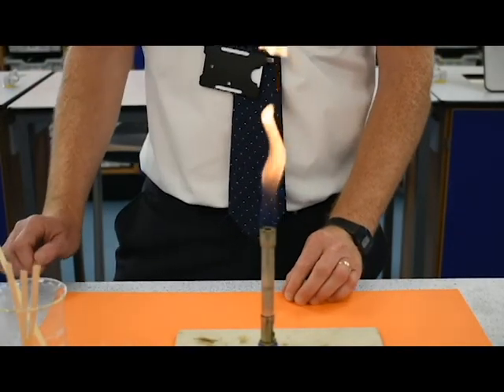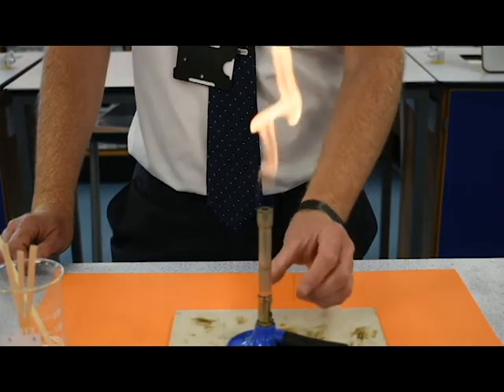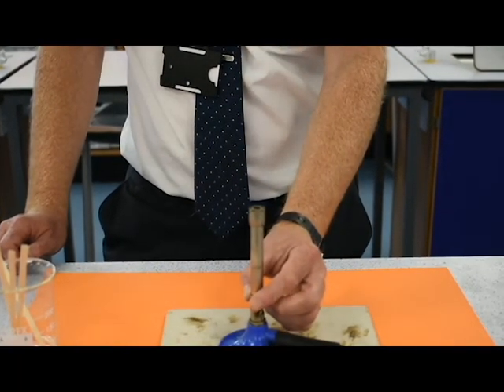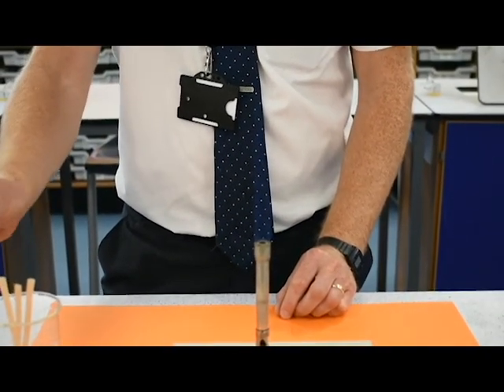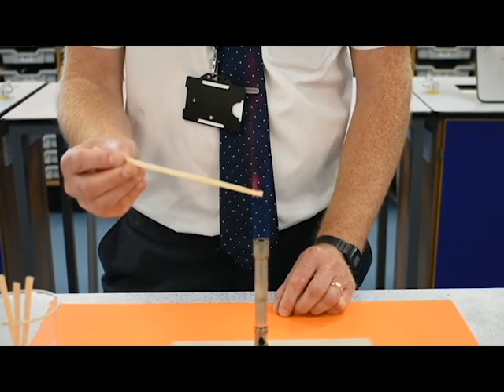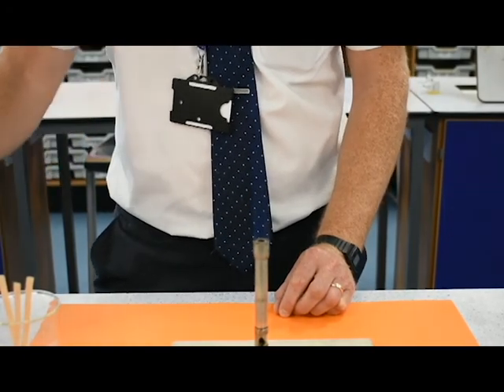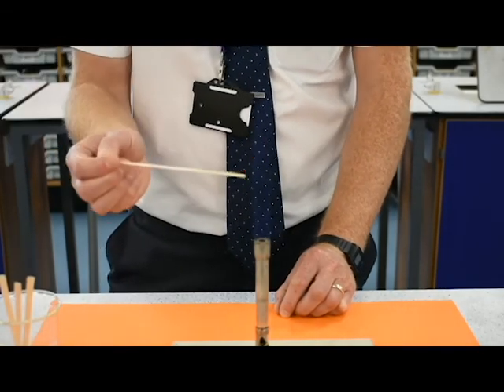Okay, so now we're going to carry out a flame test to help us identify which is which. This is on the safety flame at the moment. I'm just going to half open the air hole on the Bunsen so that we can see results. This is sample A coming in now. And now sample C.